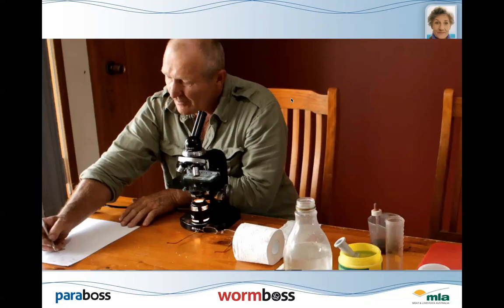And then Murray here, he's writing down his number of eggs that he's seen in relation to the mob that he was testing, and based on the slide he's using and the dilution that he's used, he will use a multiplication factor to figure out eggs per gram. Okay. Now, I'll just go on first to the next one.